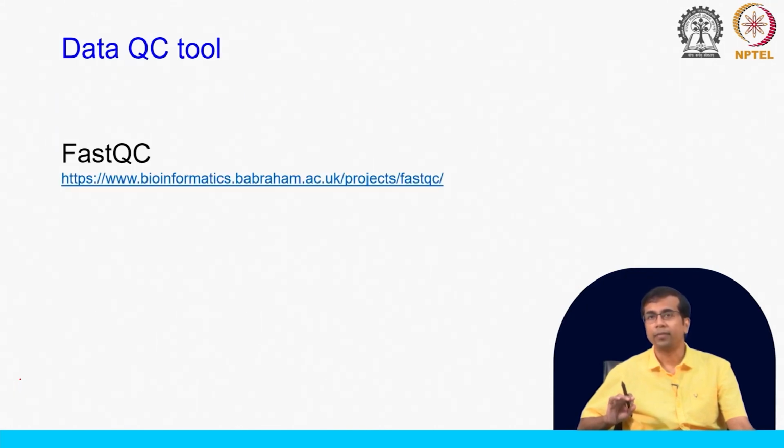There is a tool that we can use for this quality control called FastQC. This is a very popular, widely used, freely available tool, which can take FastQ data and generate a lot of statistics that can tell us about different aspects of quality control.